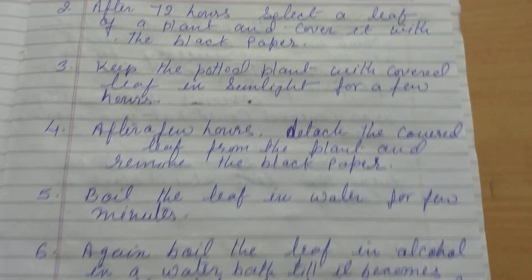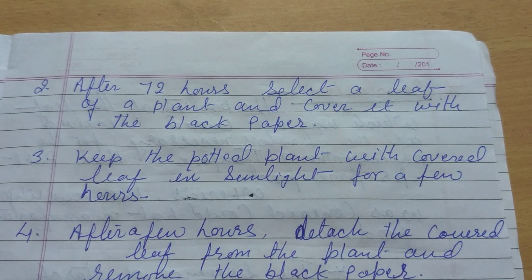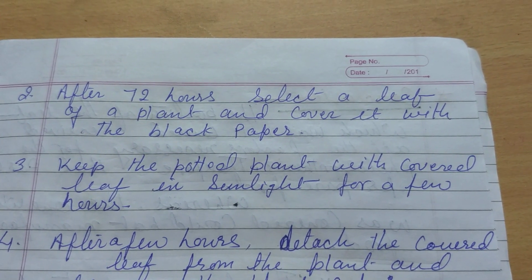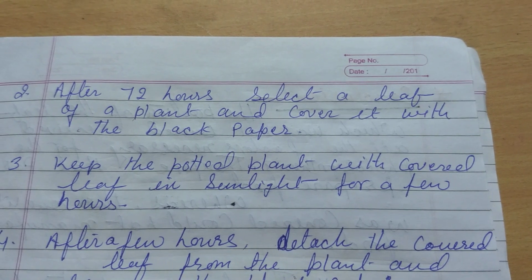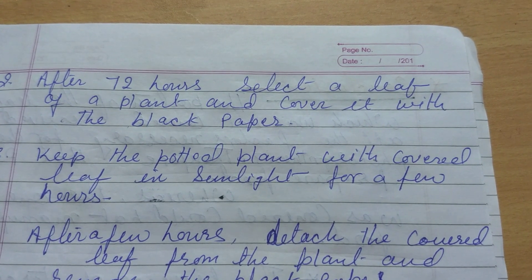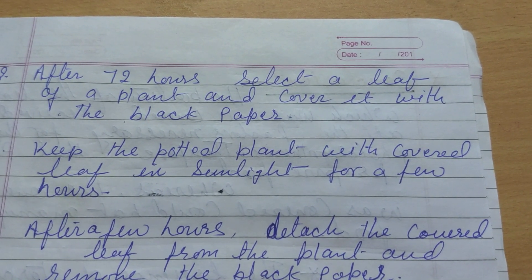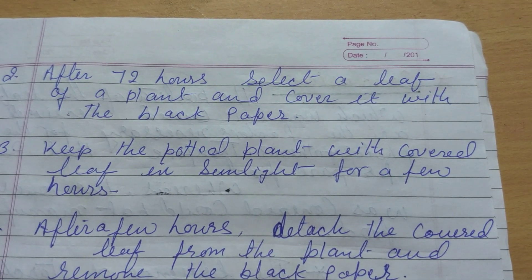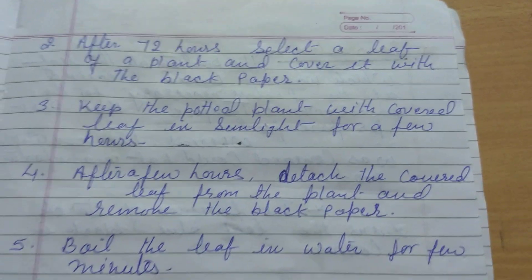The next step: after 72 hours, select a leaf on the plant and cover it with black paper on both sides. You have to select a leaf while it is still on the plant, and cover half of the leaf with black paper on both the upper side and the lower side.